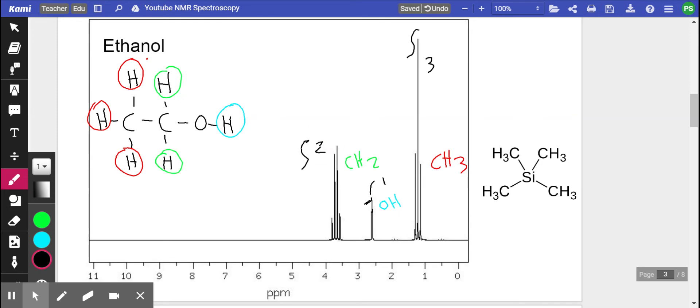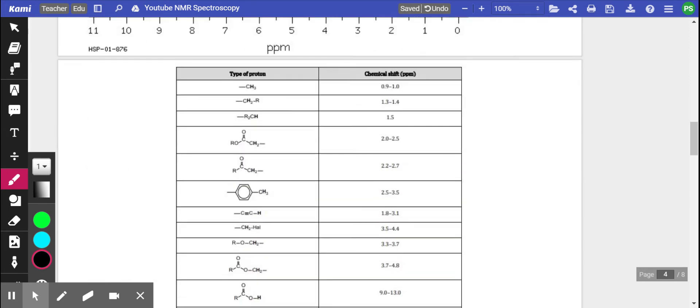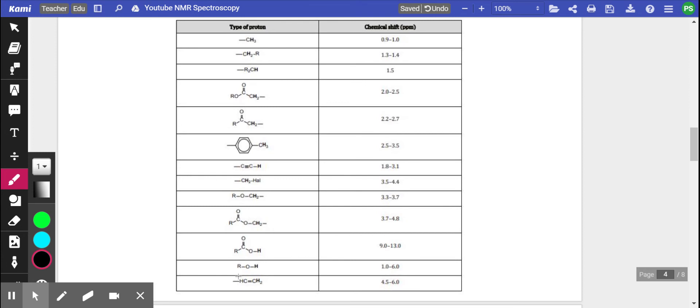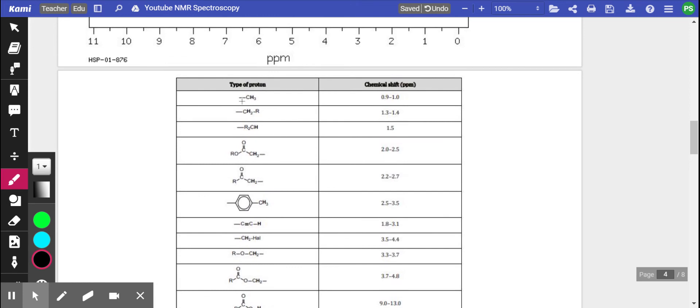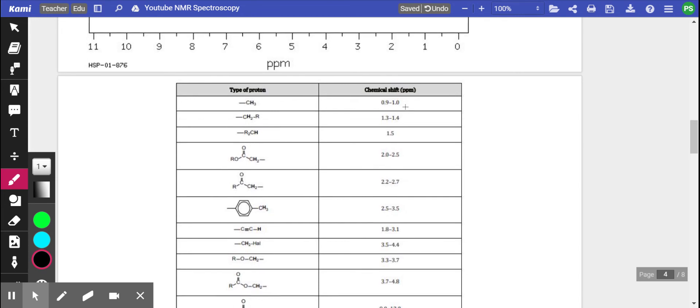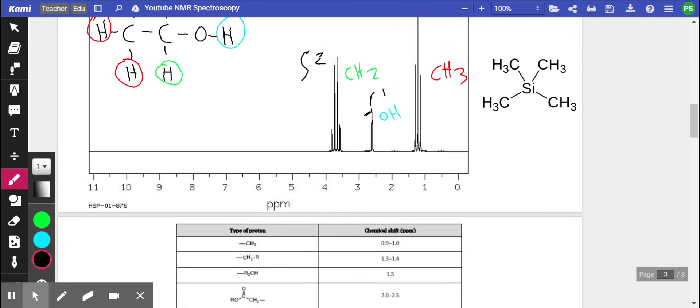Now talking about functional groups, if we scroll down to the data booklet supplied by IB, it tells you where you can find different functional groups. For example, a CH3 group far away from any electronegative elements will appear between 0.9 and 1. If we scroll back up, that is where we found our CH3 group.